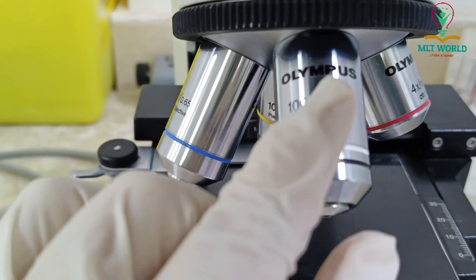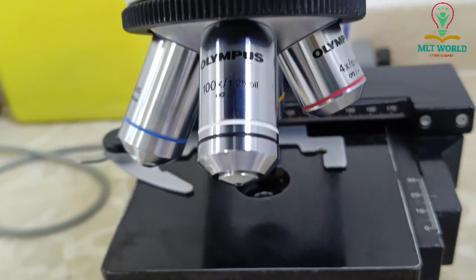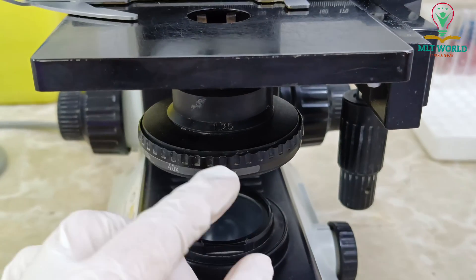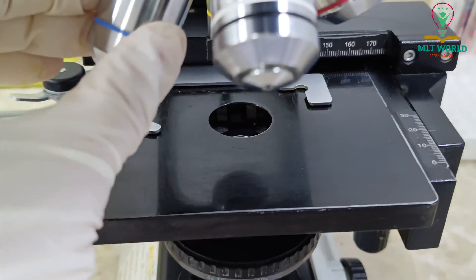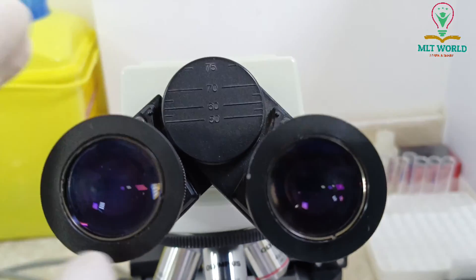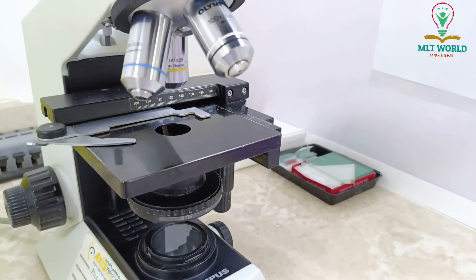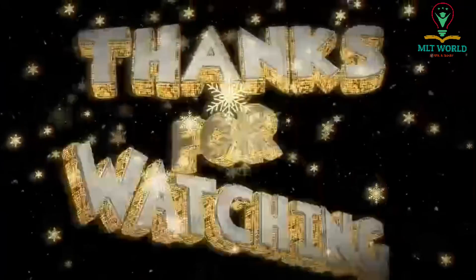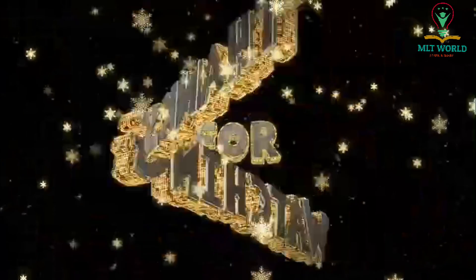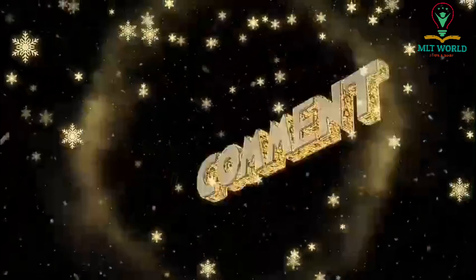This is a clearer image of the condenser. When we use the objective lens, we adjust the condenser accordingly to make the field clearer and increase brightness. At 10x keep the condenser at 10x, at 40x move it to 40x, and at oil immersion move it to that position. The eyepiece can also be adjusted for your eyes — some people make it wider, some narrower. I hope you understand how microscopy is done in the laboratory and how to use this microscope. Thank you.